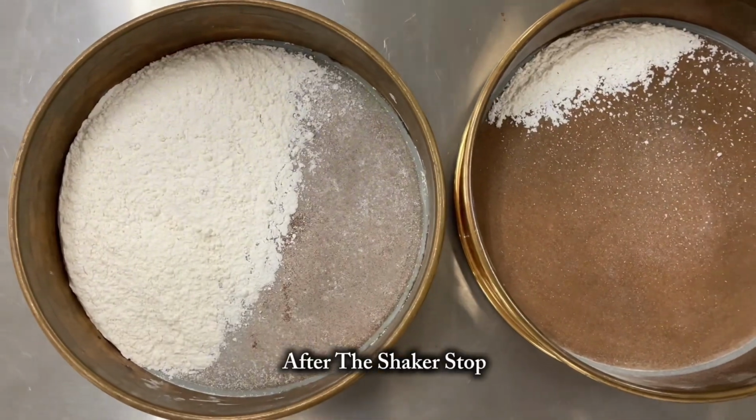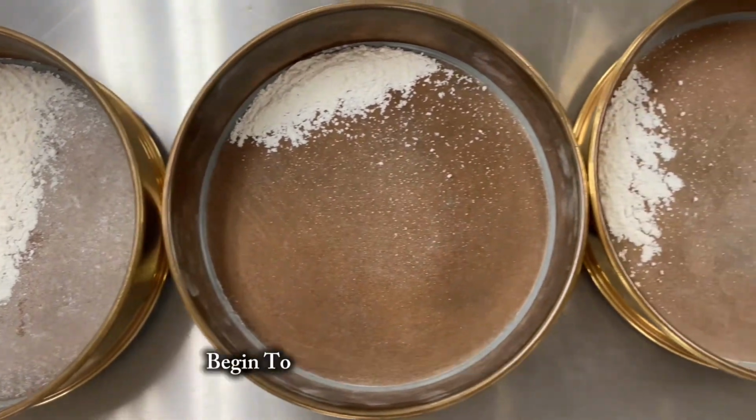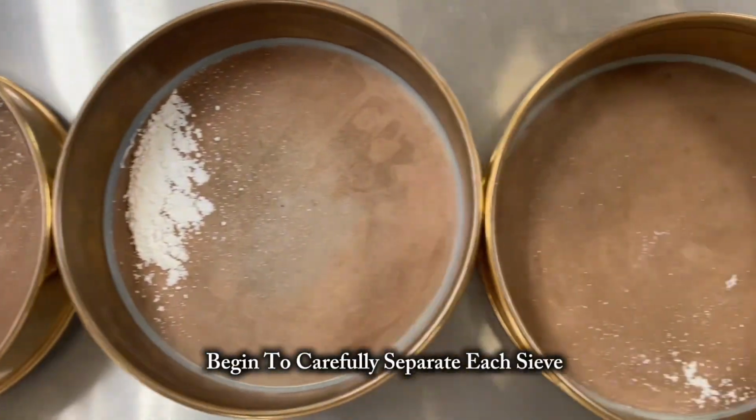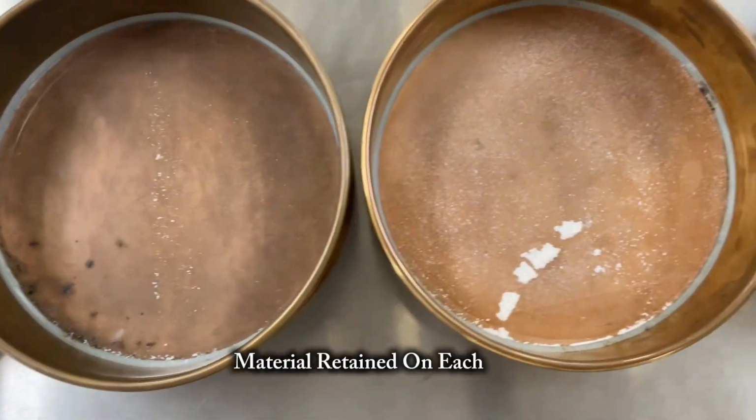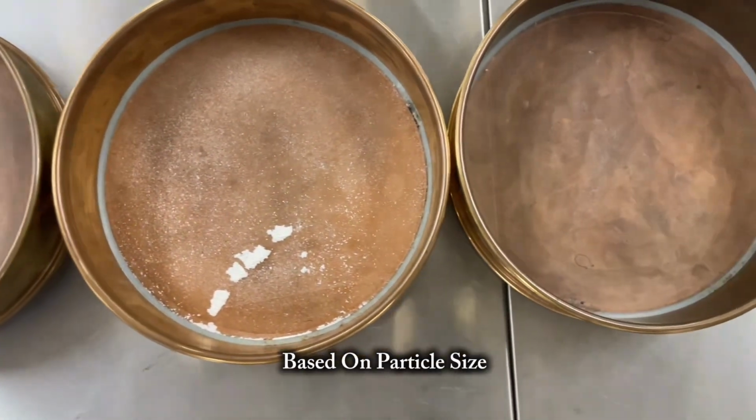After the shaker stops, we remove the sieve stack and begin to carefully separate each sieve. You will notice different amounts of material retained on each sieve based on particle size.